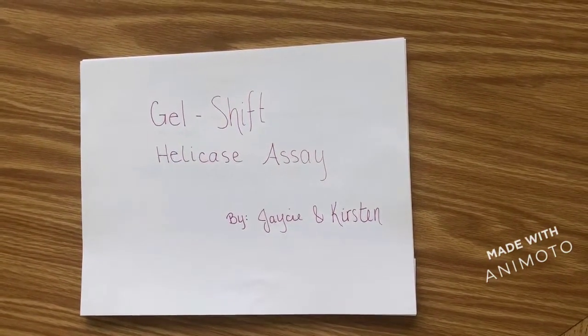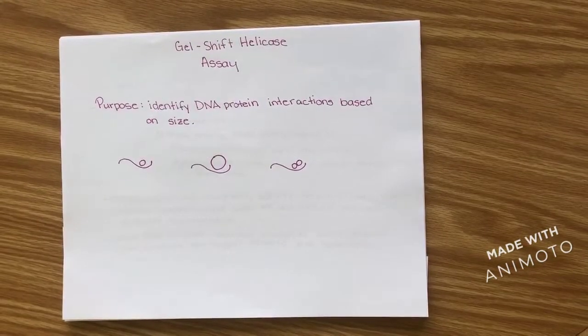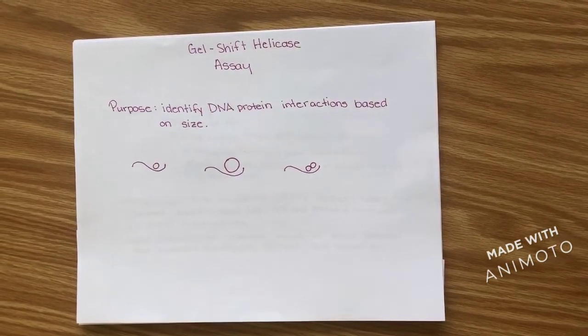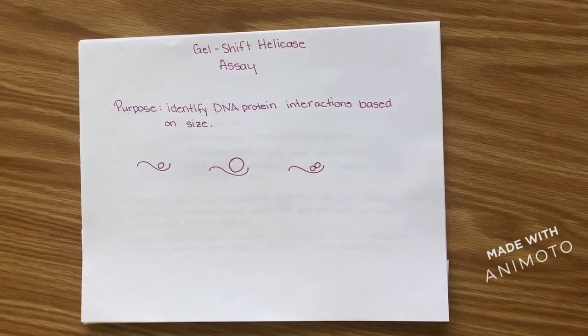Today we are going to be telling you everything you need to know about gel-shift helicase assays. The purpose of a gel-shift helicase assay is to identify DNA-protein interaction based on size. Gel-shift helicase assays are important for explaining how DNA can bind to different size proteins or even dimerized proteins.